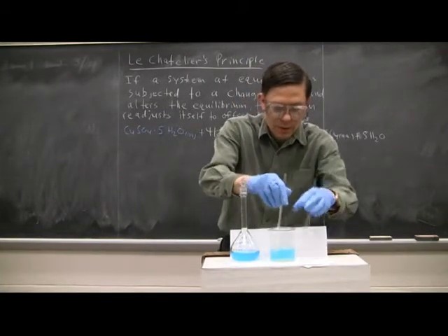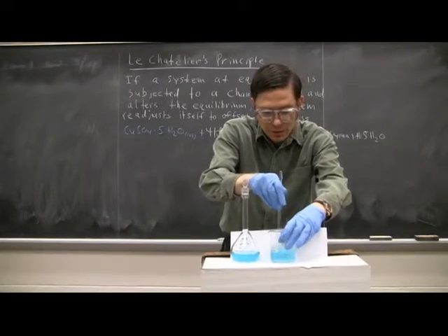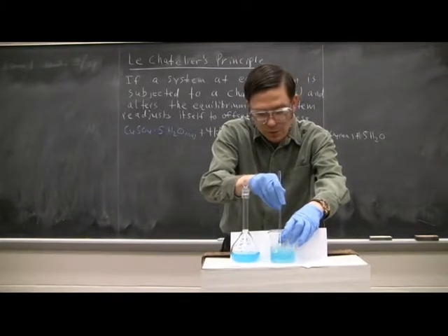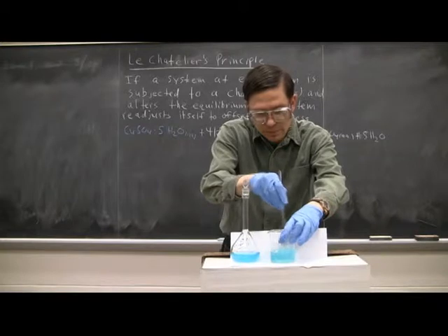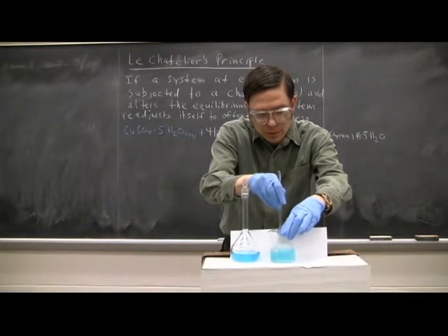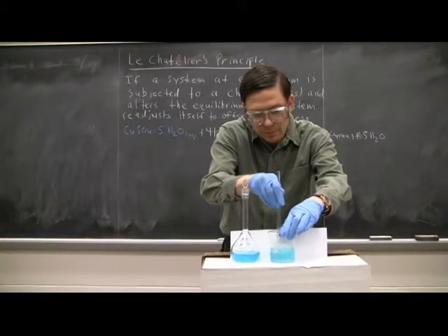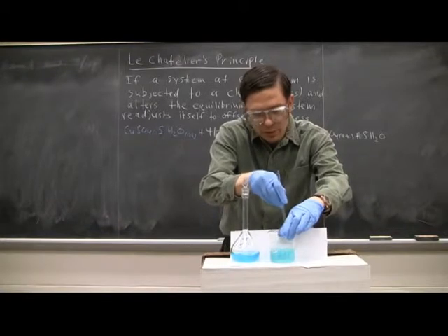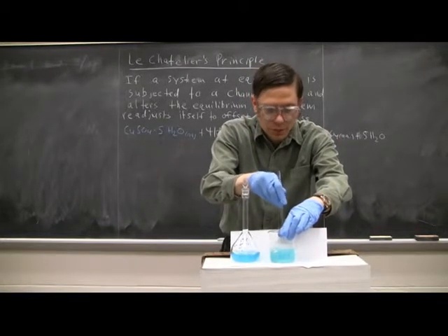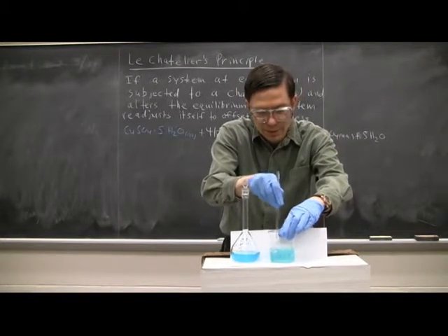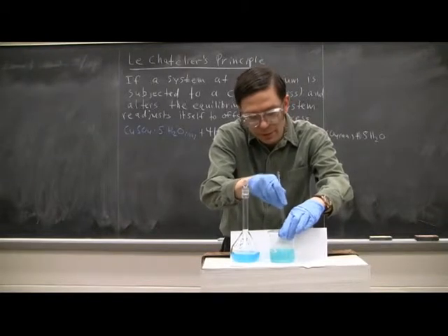I'll add two scoops here and just gradually get it to change over. And again, I'm using the volume of this glass as a comparison. You have to do it slowly because if you add too much, it will dissolve and I'll be here for a while stirring it.